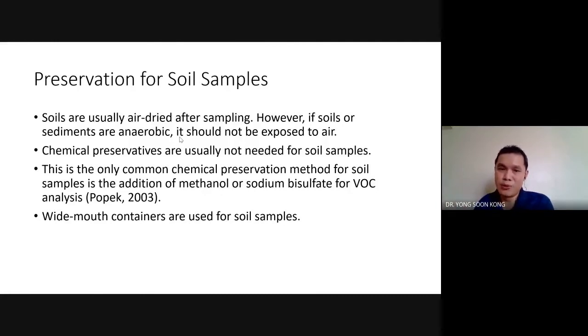And inside the bag, I told you not to seal it. Why? Because the moment you seal it, it becomes low in oxygen and it becomes anaerobic. What anaerobic means is it doesn't have air inside, but your soil still has bacteria. So what happens if bacteria survive under anaerobic condition? It changes the soil chemistry. So that is why I asked you not to close it, yeah? So that it represents the actual soil.